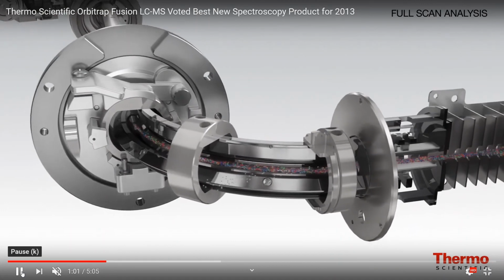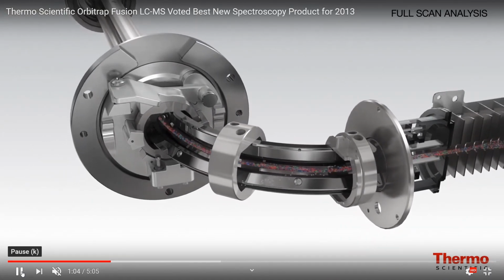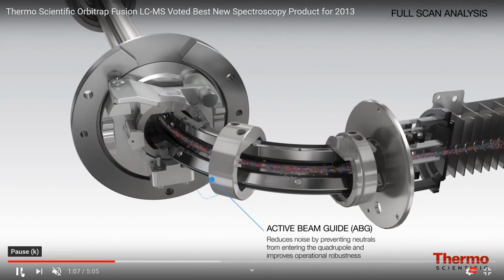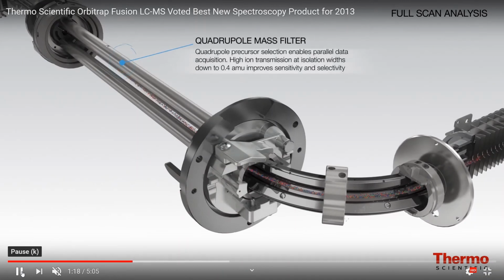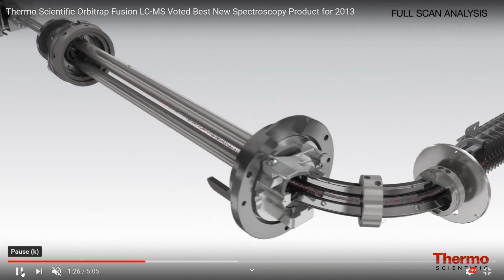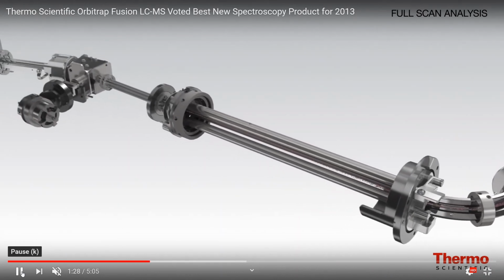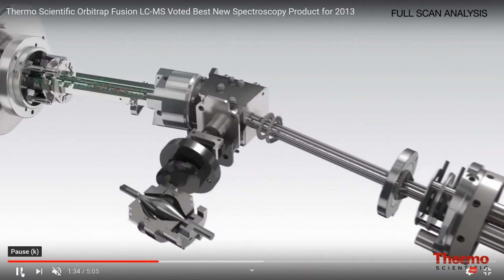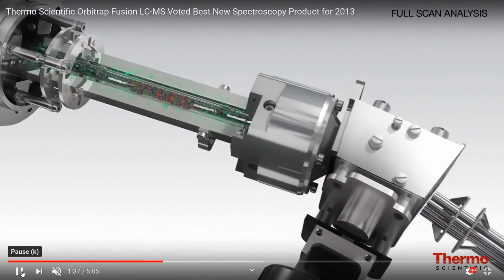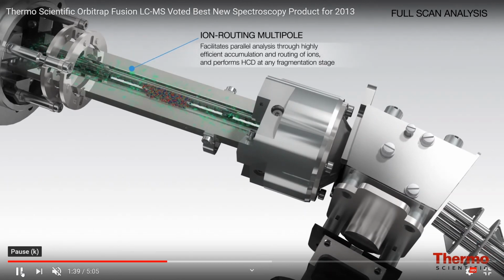So this is an ion beam in our Orbitrap mass spectrometer. It's now passing through an active beam guide. This allows us to remove neutrals. They're not bent in the guide. And the beam is now passing into a quadrupole mass filter. Here we can select the ions that we wish to fragment. Passing through the quadrupole filter, they then pass beyond the Orbitrap into this routing multipole. And here, this is where fragmentation takes place.